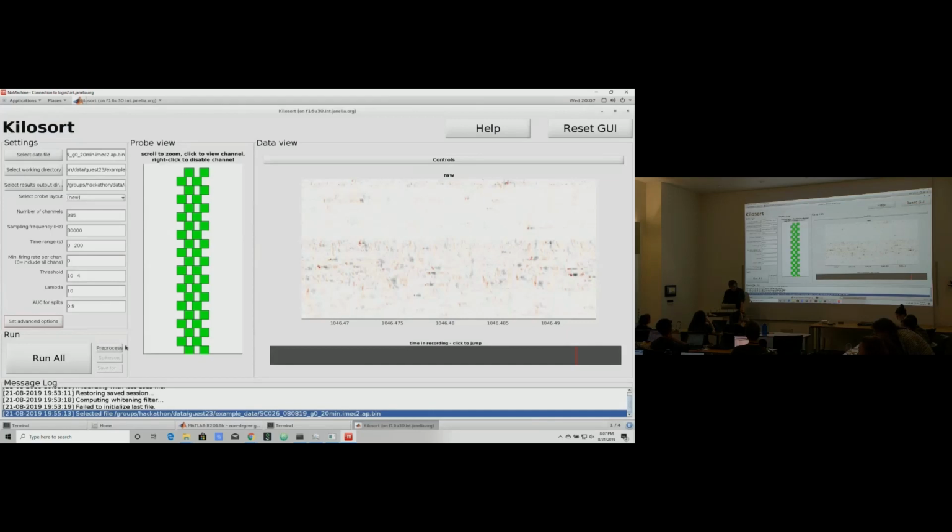Okay, and in the GUI here you can run things in stages, and I recommend doing that because we can inspect the output of every stage. So I just pressed pre-process, and it's pre-processing. Okay, looks like it's working. So we can now wait. You've probably pressed run all, which will run all the different steps, and you'll basically still be done pre-processing. Good.